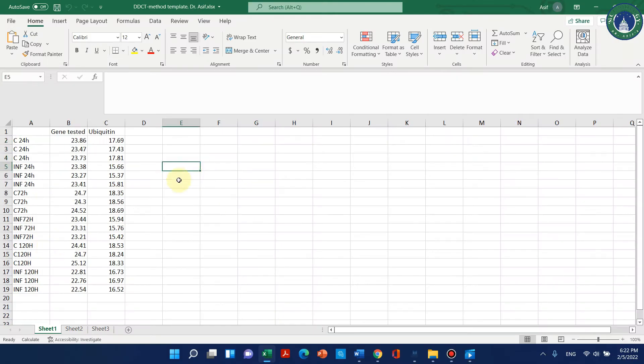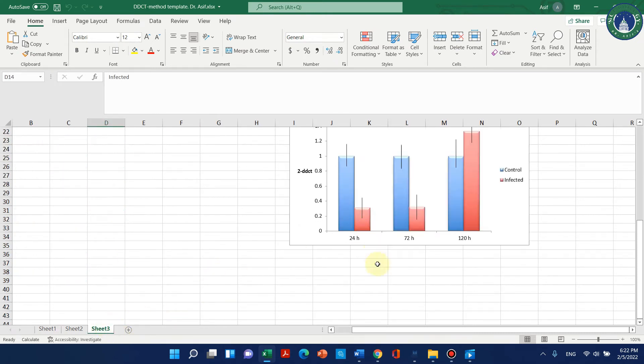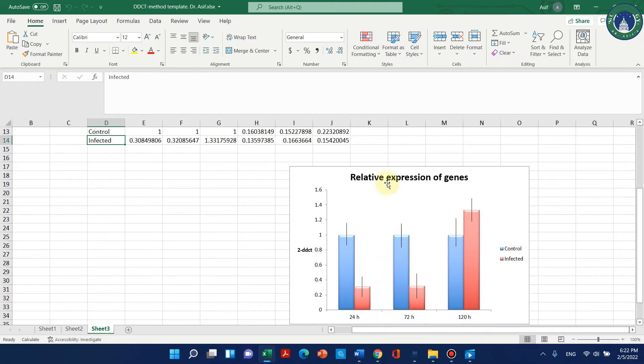Welcome to another video tutorial. In this video I will show you how we can change our CT values data to a graph for qPCR relative expression data of the genes.